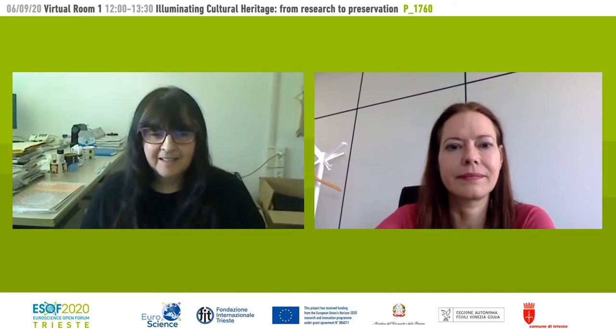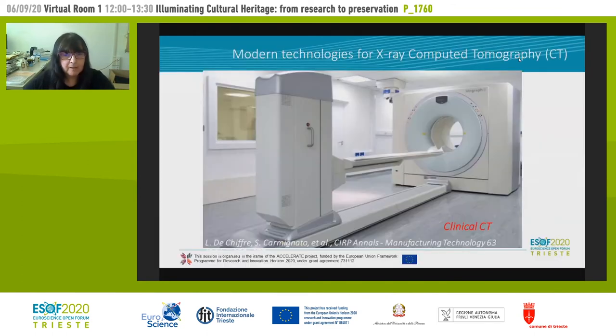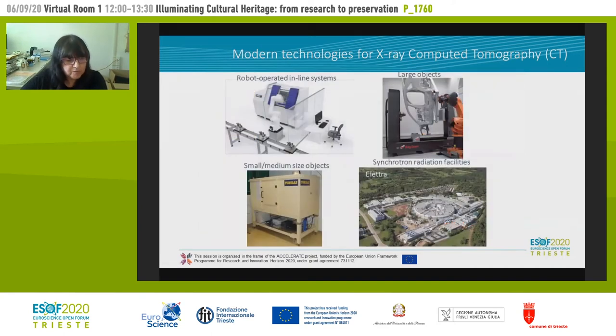Thanks, Jana. Good morning to everybody, and thanks for joining this session. I will speak about 2D and 3D X-ray imaging techniques for cultural and natural heritage, so with a complementary approach with respect to the neutron investigation that my colleagues presented before. I will speak mainly about X-ray computed tomography, and all of you know this type of instrumentation for clinical CT to perform computed tomography studies, but there are other instruments that can be used for this kind of experiments, especially in the case of material science, biomaterials, and geomaterials.